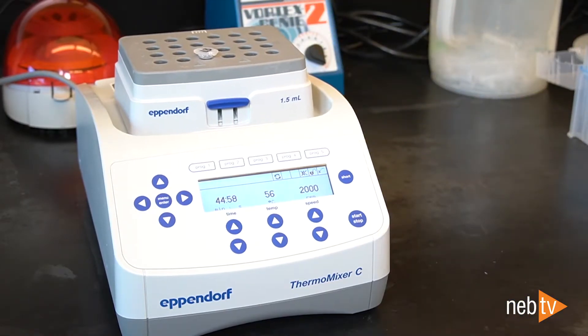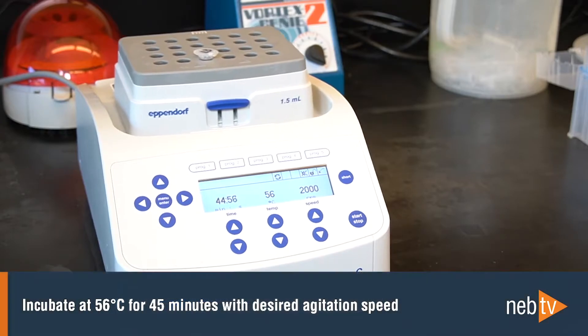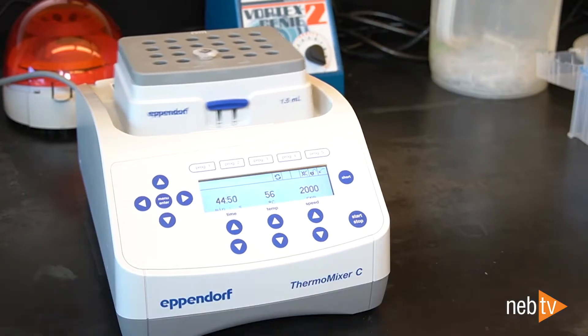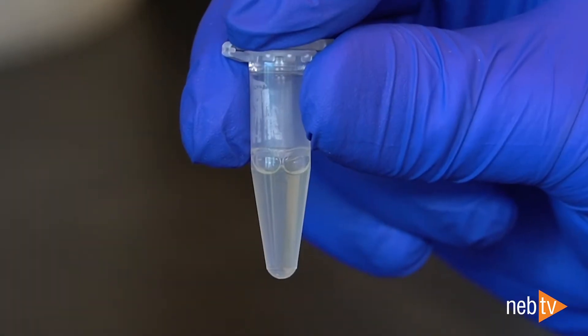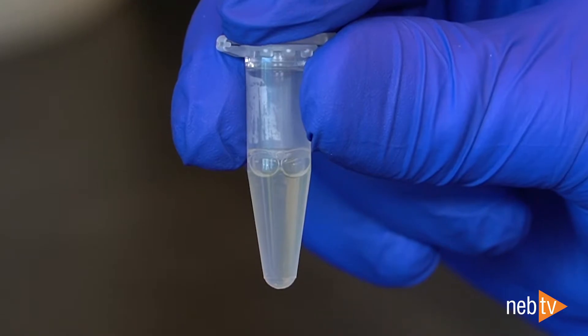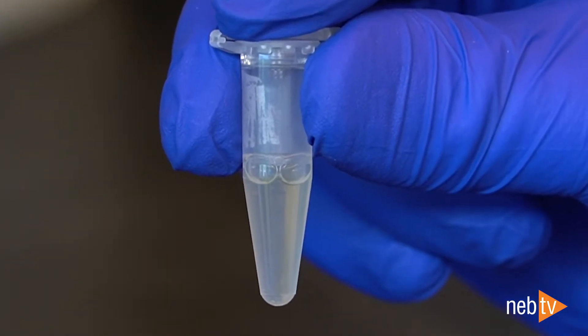Regardless of the homogenization method used, the sample should be incubated in a thermal mixer at 56 degrees Celsius for 45 minutes with agitation at the desired speed. When working with brain, muscle, or any low input samples, stop the agitation after 15 minutes for the best yield. Finish the incubation without shaking. When lysis is complete, samples will have changed from turbid to clear or mostly clear, depending on the tissue type.